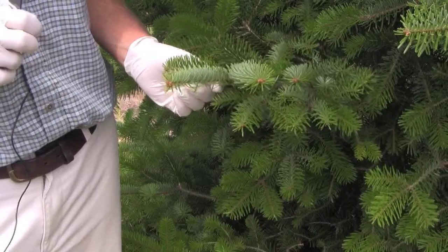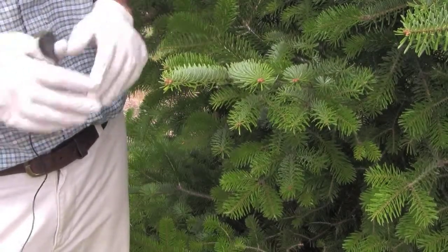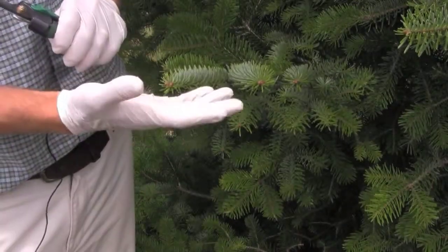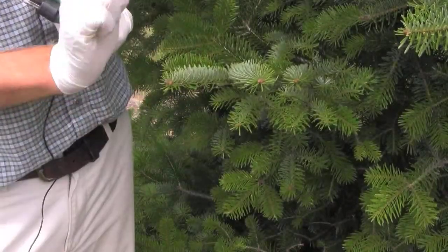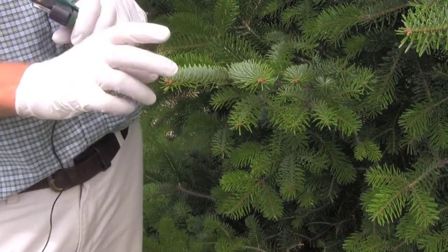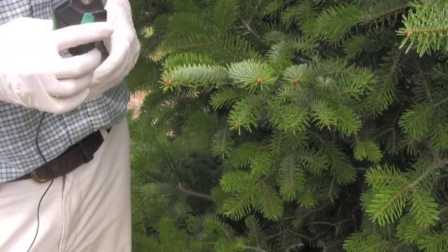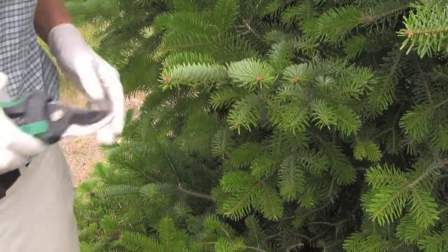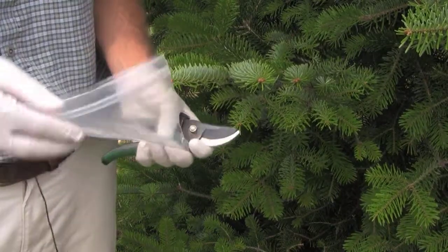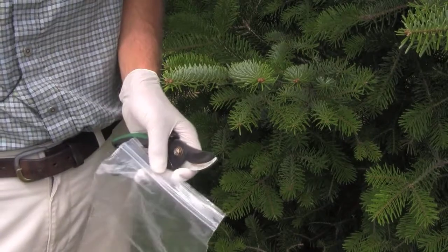When you come to collect a foliage sample from an individual tree, I recommend getting a pair of cheap latex gloves. The perspiration from your hand will contaminate the sample, particularly with potassium, so gloves help keep it clean. You also want to have some clippers, and you'll need a plastic bag — a regular Ziploc bag — to collect the sample in.